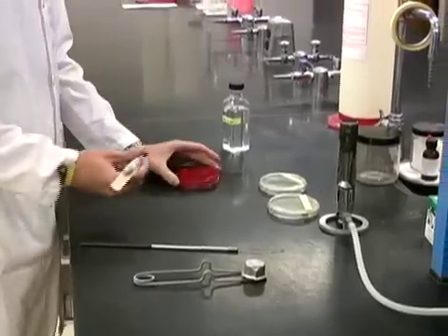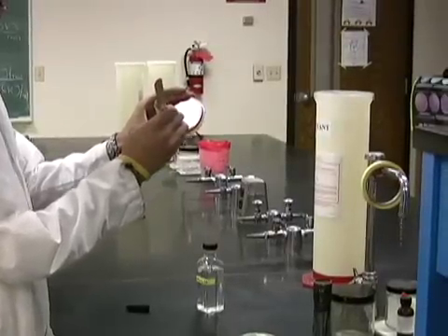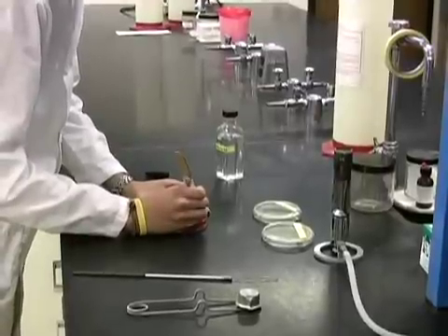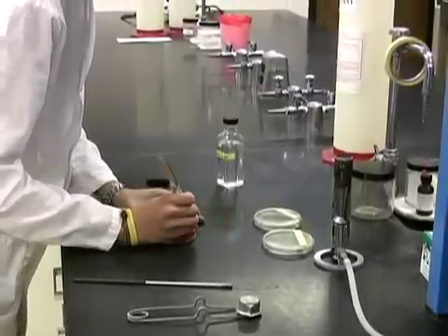In this procedure, we will be streaking on blood agar plates, also called BAP. Using a Sharpie, divide the plate in half. We will attempt to streak for isolation using only half of the plate. Diagrams of this procedure are provided in your lab manual.